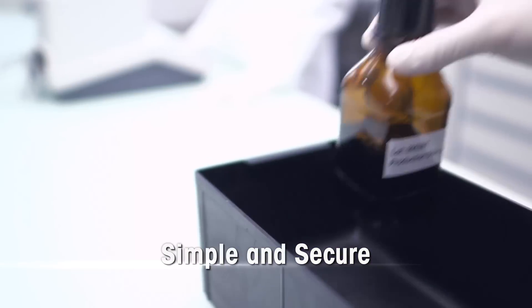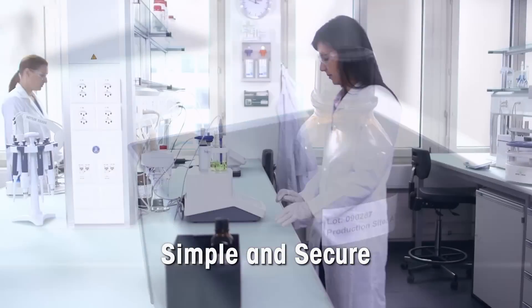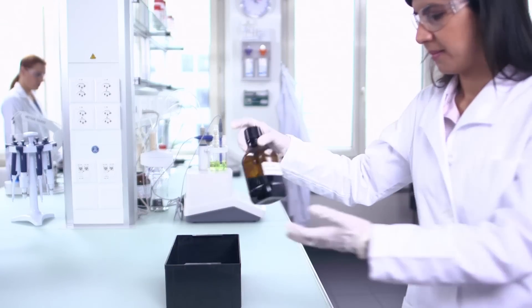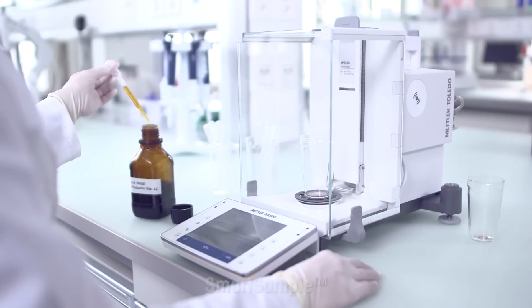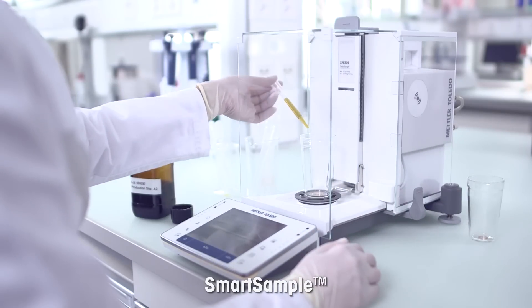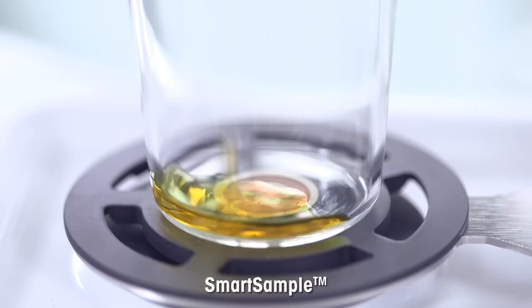Mettler Toledo's titration excellence line instruments are tailored exactly for user workflows. SmartSample uses RFID technology to optimize workflow efficiency.